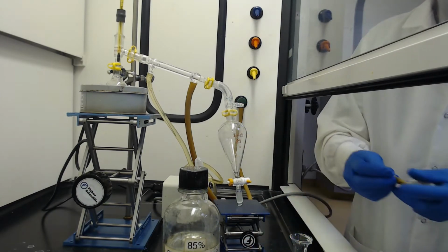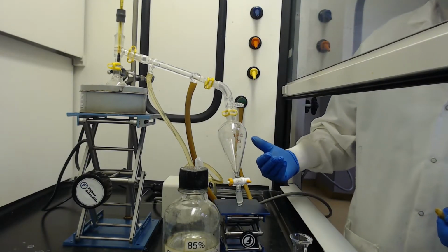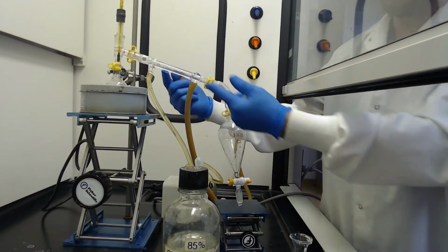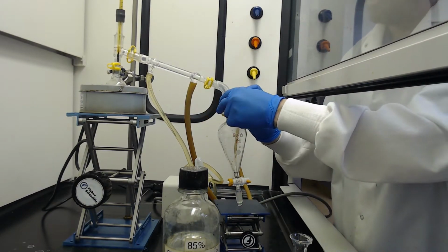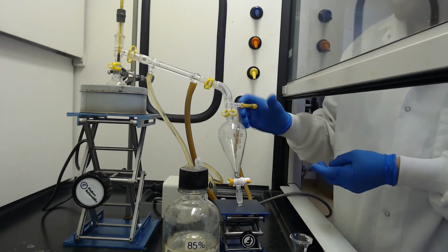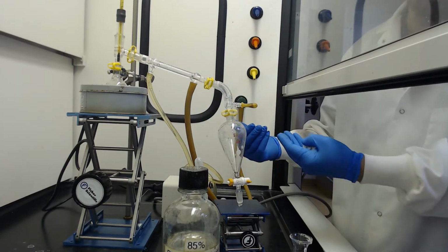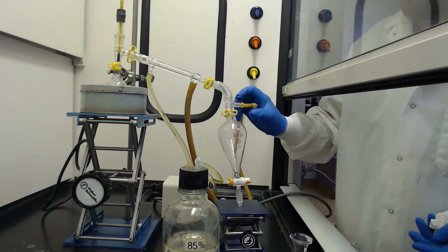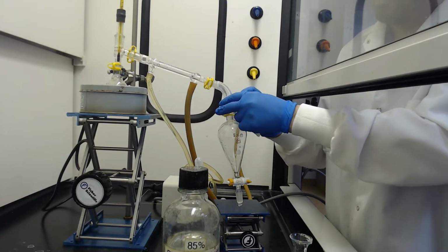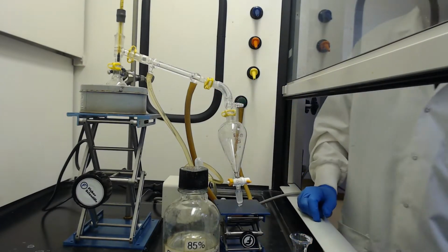But what I do have is this little stopcock bolt. Our product is pretty volatile, so we don't want to lose our product. Once we get this up to temperature and we start distilling, I can put this on here, and as long as the temperature stays the same, we shouldn't have any pressure buildup. It's on here pretty loosely, just to keep it from volatilizing back out once we collect it. If pressure were to build up from a temperature change, it could easily blow this off before the glassware is going to get exploded all over the place.